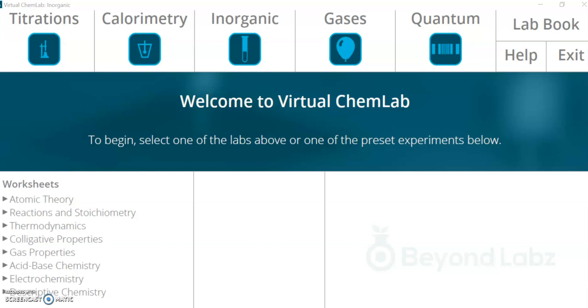Hello, this is Brian and today's lab is the identification of cations in solution: barium, strontium, calcium, and magnesium.